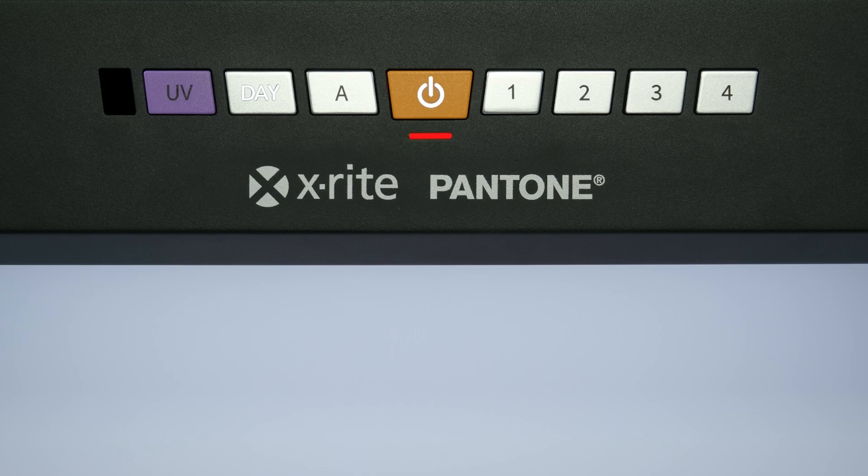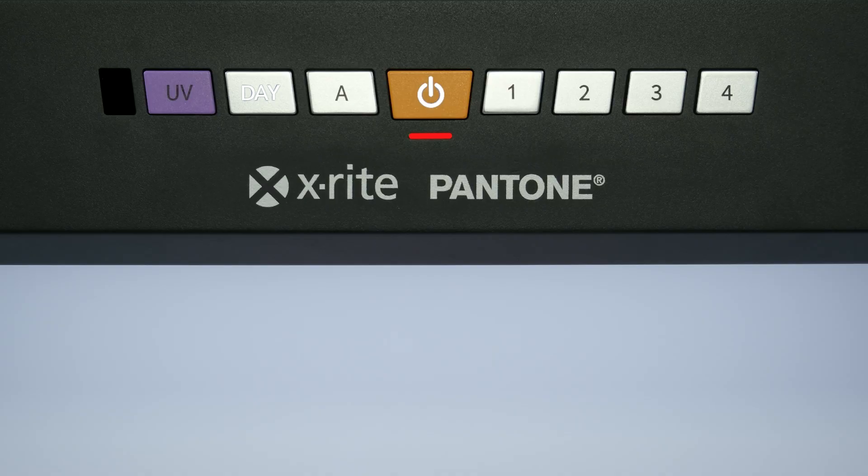If the LED is red, the illuminants are out of the manufacturer's stated lifetime and you should contact X-Rite service.